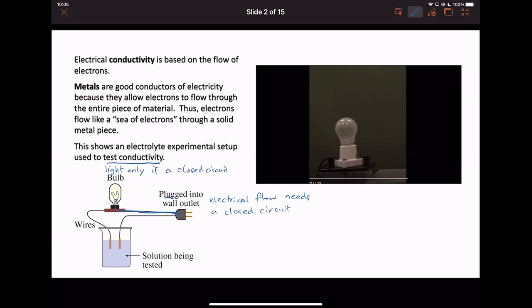And so continuing to follow along, this wire continues on here and it ends in this electrode. So there are two electrodes. Okay, we've seen two electrodes before. That was in the single replacement lab. The two electrodes in two different beakers, the beakers have to be connected with a string to close the circuit. So what will connect the two electrodes here, this blue side, and then this other electrode is the red side.